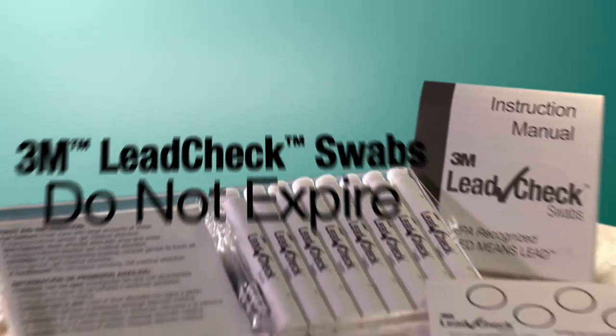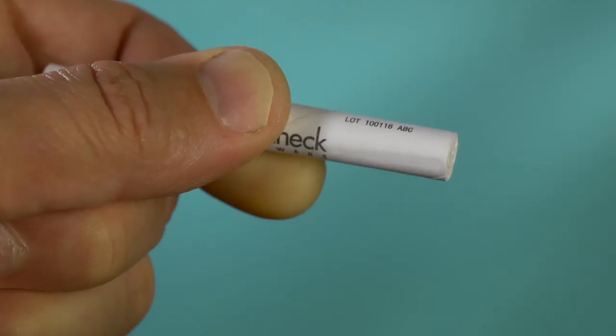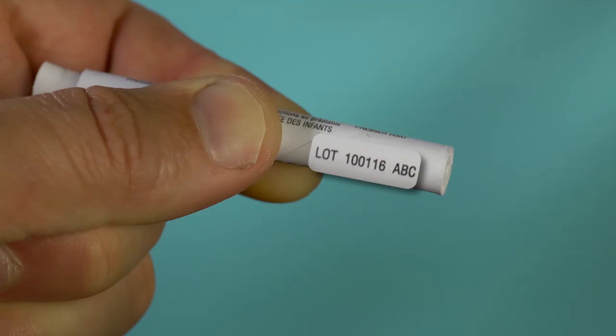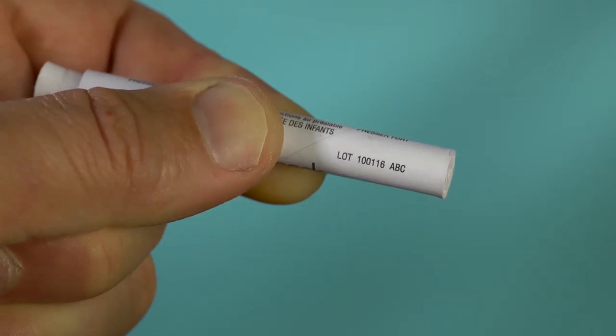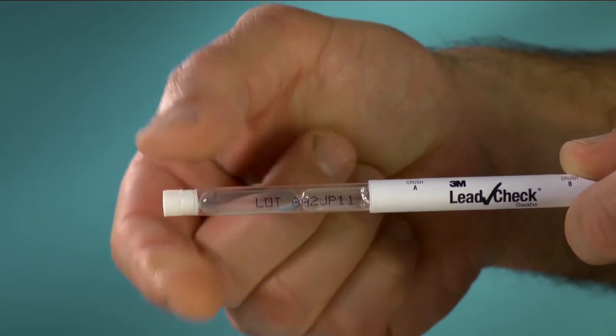3M Lead Check swabs do not expire, so when filling out the EPA form, use the lot number shown on the swab in the expiration date field. The lot number can be found on the cardboard cover or on the plastic tube underneath the cardboard cover.